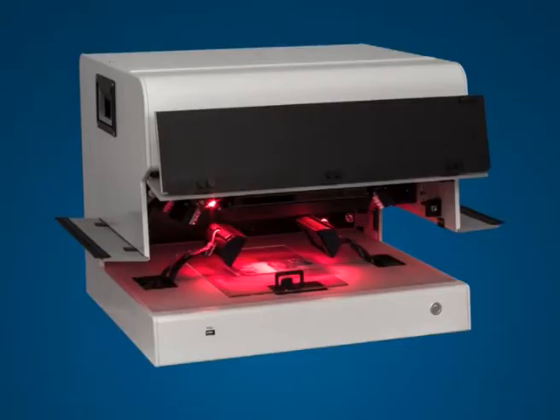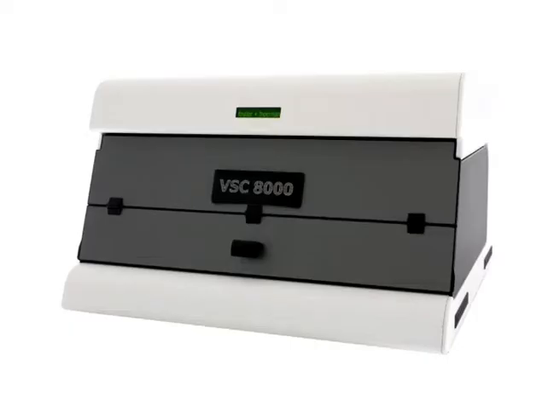Video spectral comparator is state of the art equipment which provides valuable help in forensic analysis of documents and its ingredients. VSC is an abbreviated form of Video Spectral Comparator. It is a PC based imaging system. VSC has a series of equipment. The latest and upgraded version is known as VSC 8000. This VSC is suitable for almost all types of problems encountered during document examination.